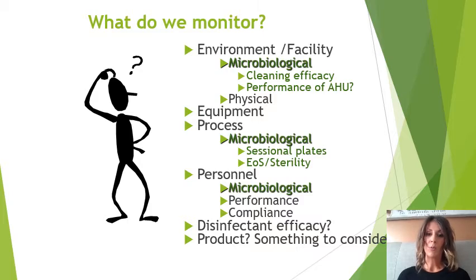We also have to make sure that we're monitoring our equipment. So essentially, when it comes to equipment, you want your equipment to be within certain parameters and to not deviate from that. They are set at certain parameters to reduce the risk of contamination either to the operator or to the product itself. We are always thinking of lowering the risk of microbial contamination to the product. Therefore, we work in things like laminar flow cabinets or isolator cabinets, where you can achieve a grade A environment, so a sterile environment. We need to be monitoring those and making sure that every day they are performing to the correct specification.